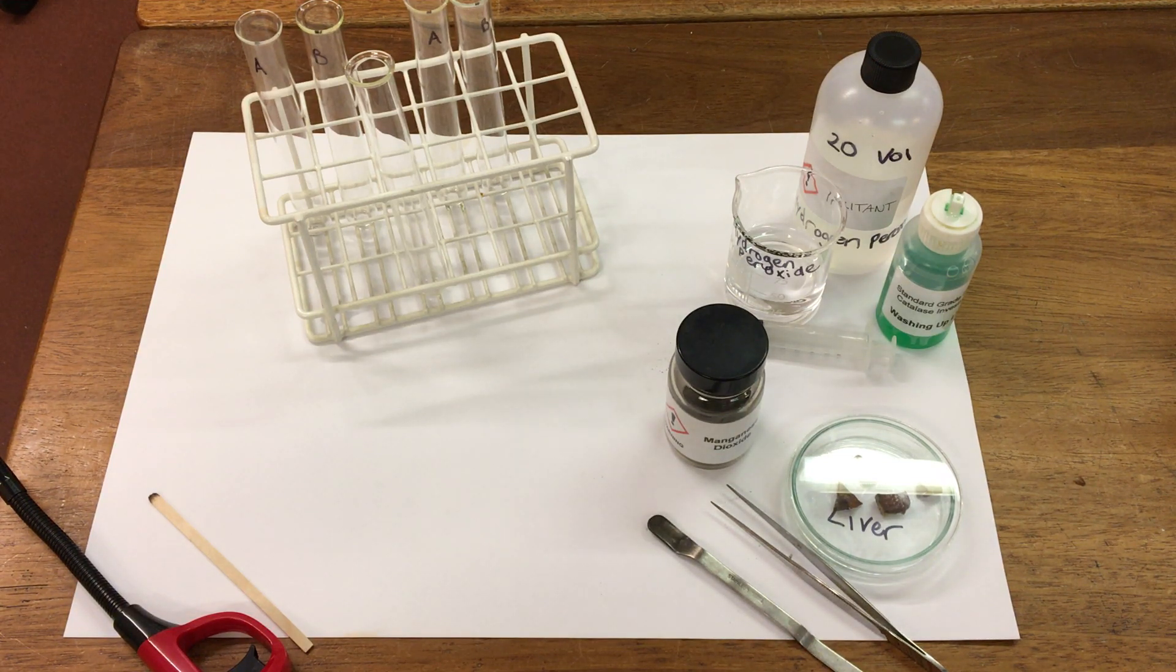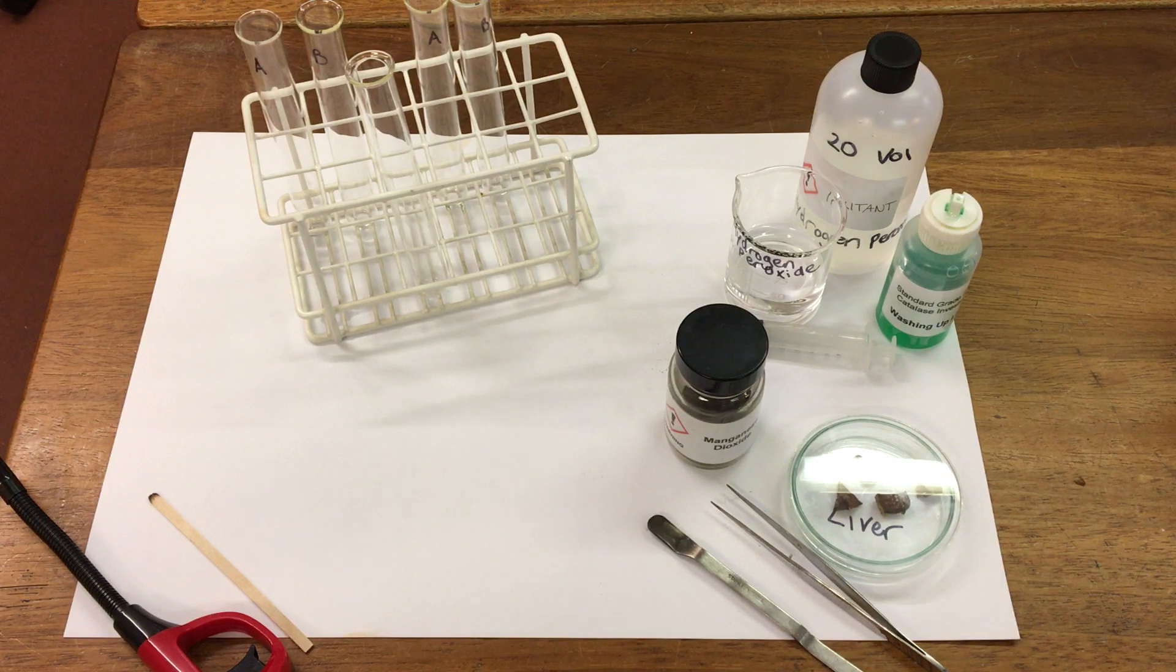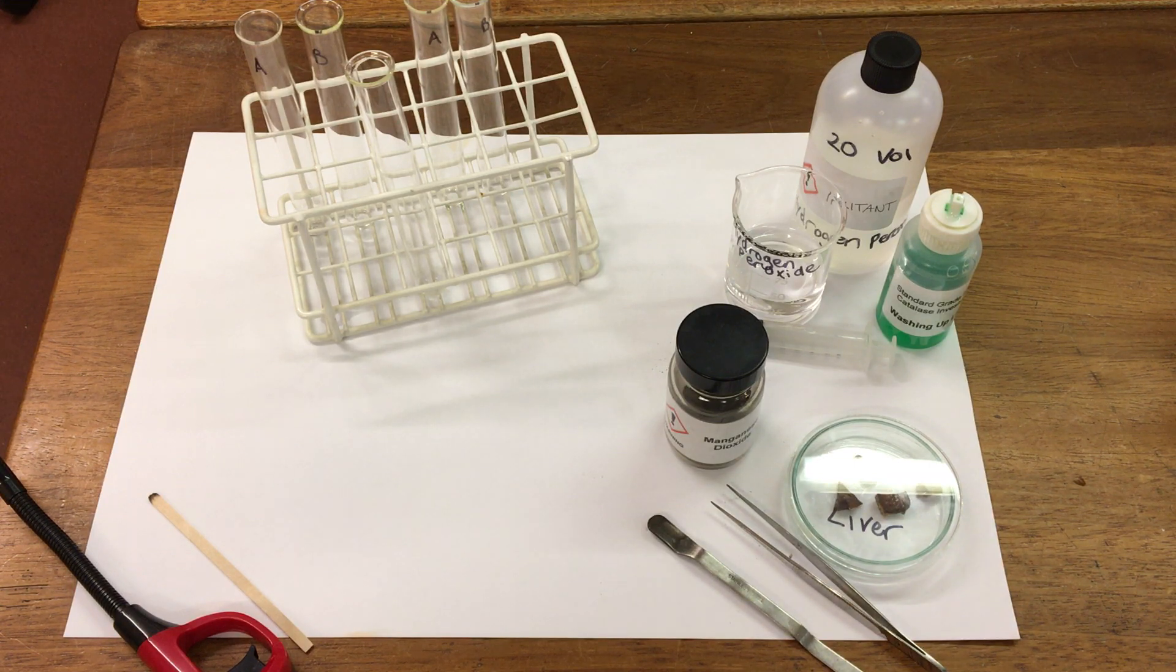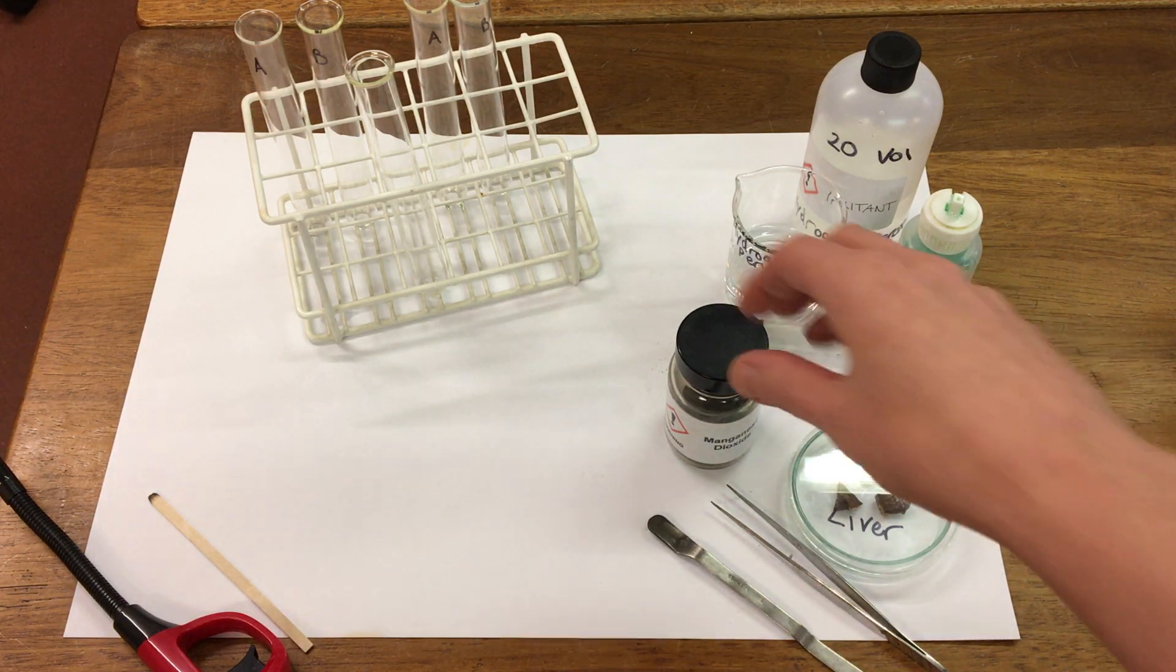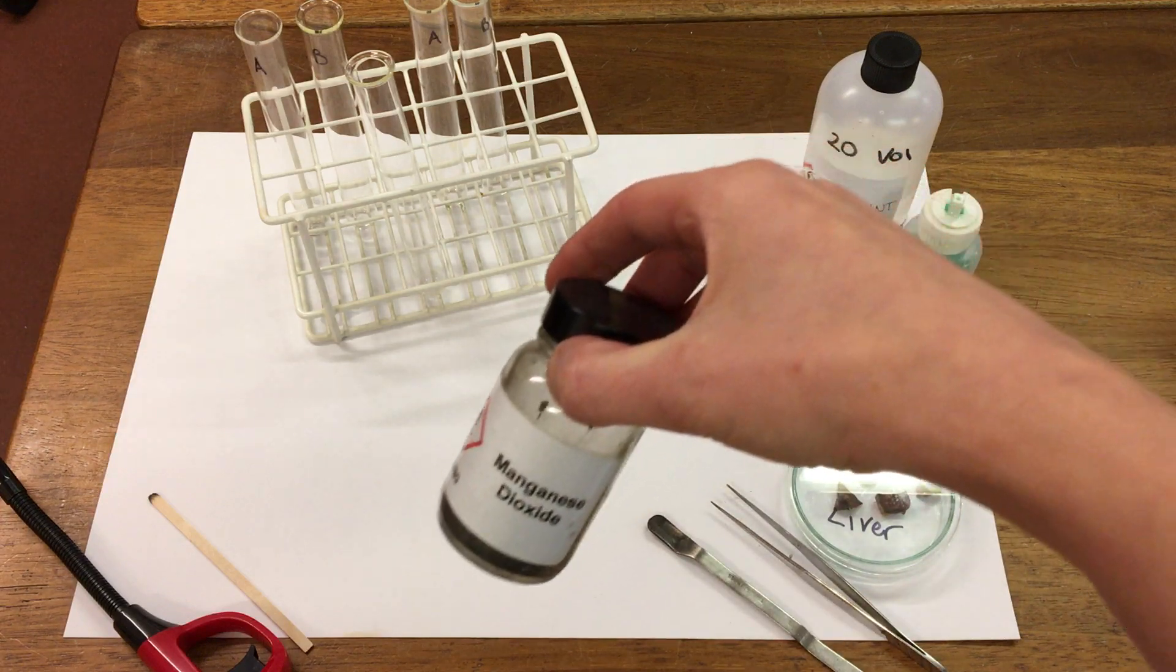In this experiment we're going to investigate the effects of a catalyst on hydrogen peroxide. When we add a catalyst to hydrogen peroxide a gas is produced. I'm going to show this by using a catalyst manganese dioxide.